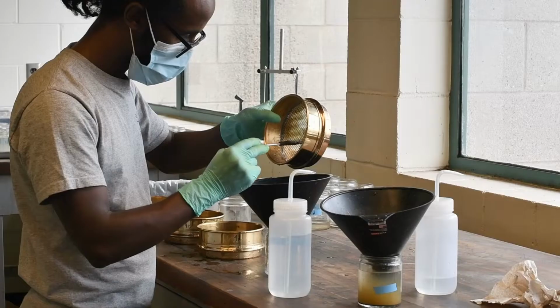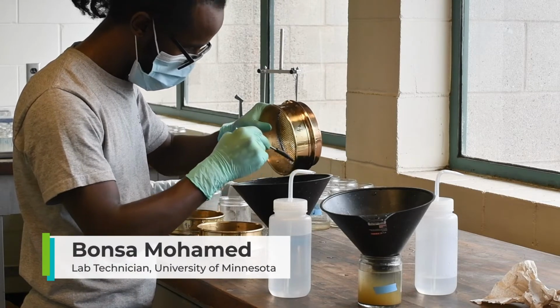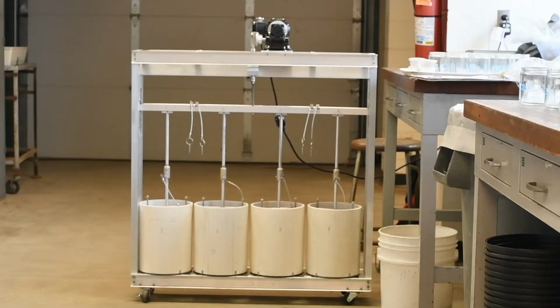health data. In this video, we'll follow UMN's lab tech, Bonsa, as he walks us through one soil health indicator, aggregate stability, and one Science of Soil Health method for evaluation using a modified Yoder device. On paper, this method can seem pretty complicated, but hopefully by the time we've walked you through it, you'll be running it yourself.